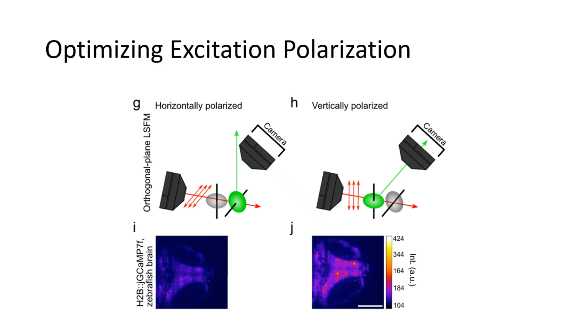Photodamage depends on both average power and peak power squared. Keep the average below roughly 16 milliwatts at the back pupil while shortening the pulse width to 100 femtoseconds and dropping the repetition rate from 80 MHz to a few MHz. That lets peak intensity rise, great for two-photon efficiency, yet leaves the mean thermal load unchanged. Line scanning or light sheet strategies further spread the dose, allowing 2-minute time-lapse recordings of hippocampal slices with no observable swelling or bleaching.